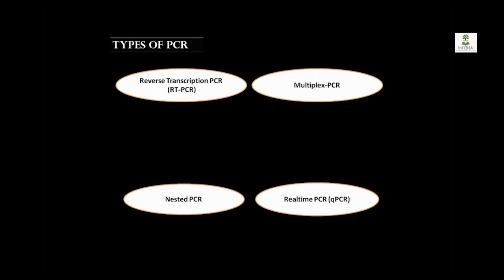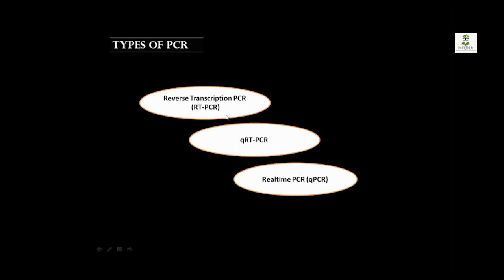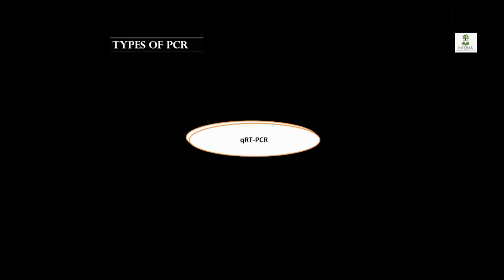Now coming to the types of PCR, there are different types of PCR which we use according to our need. But one of the most important and most frequently heard by the public during the past two years is the combination of these two types known as the qRT-PCR, which is used for testing of COVID-19. Since the COVID-19 virus consists of RNA particles, this RNA particle has to be first converted into complementary DNA by a process known as RT-PCR, and then this complementary DNA subjected to qPCR. So the whole process is known as qRT-PCR.